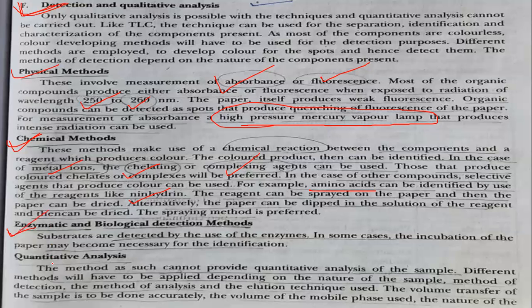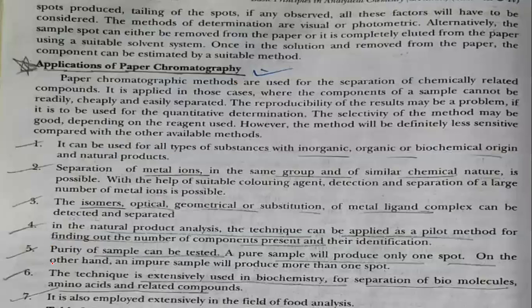Okay, so in the quantitative analysis, the method as such cannot provide much information regarding the quantity of components present in the sample. And even the technique is not much accurate. Okay, so this is the information regarding paper chromatography.